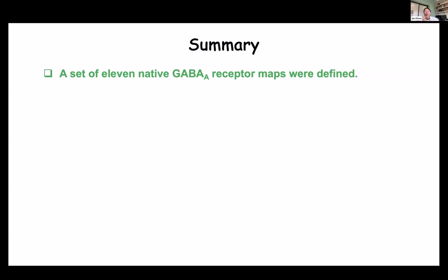It will indeed affect your yield because some of the receptor is aggregated. But we indeed do mass spec to investigate what's inside. But the subunits inside are kind of similar to what we get, so the composition could be in a similar way.